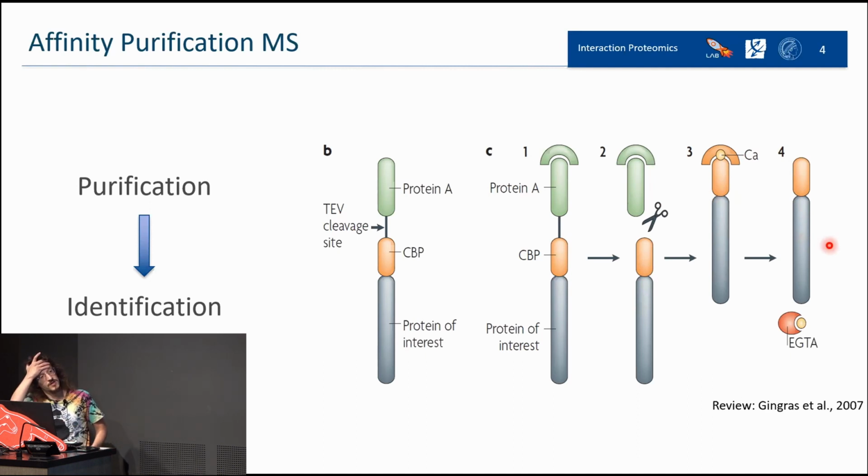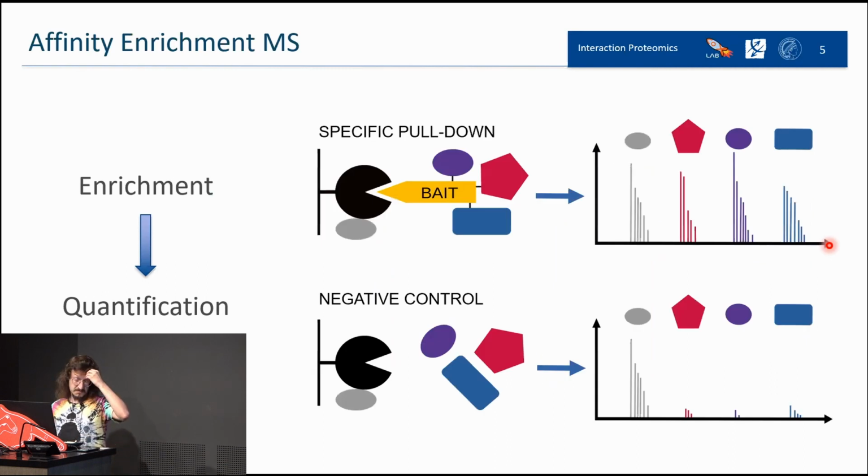As you can see, usually you need to prepare your sample. You need to do several washes. You need to remove everything that is unspecific binder and that you didn't want to analyze. And as you can imagine, this approach is kind of complex and also requires time and money. But then something like 7 years ago, a new approach was introduced. I mean, not so new anymore, but the nice thing of this approach is that you don't care whether you remove your unspecific binders or not.